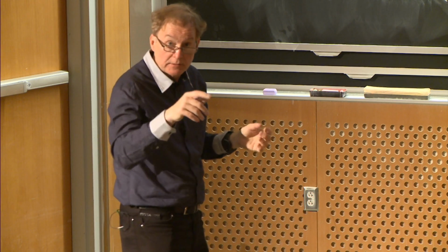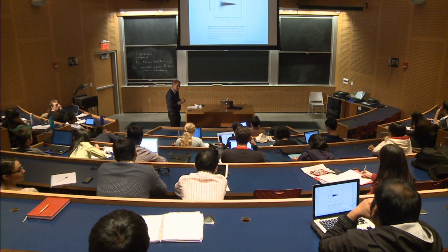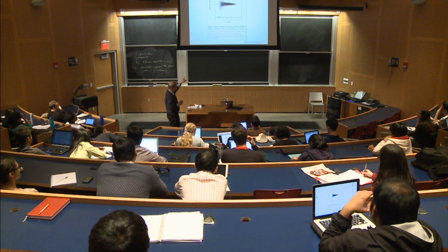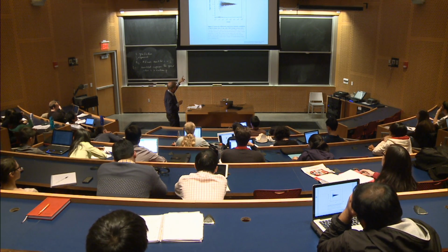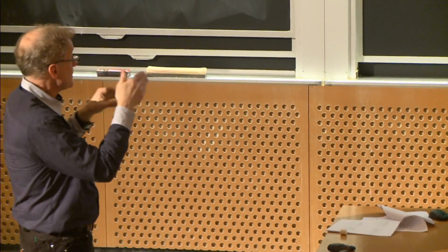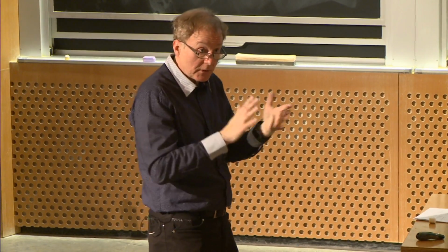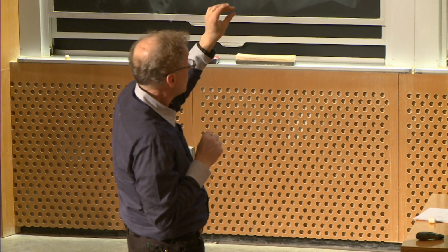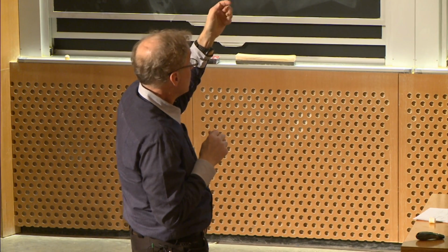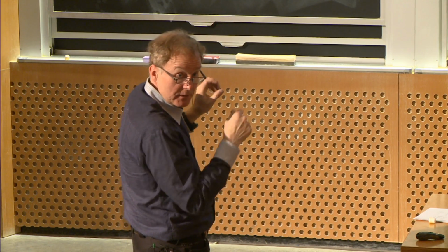Any questions at all? Yes? Why is the significance threshold lower as the mean increases? This chart. Why is the significance lower? Or the threshold. Oh, because as you increase the number of observations, the mean value theorem is going to cause things to get closer and closer to zero. And so you need less of a fold change difference to be significant as you get more and more observations.